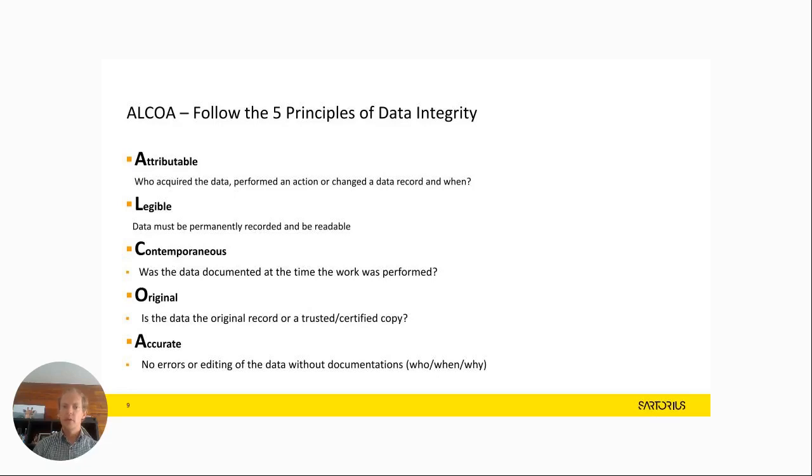The second point, legible. Data must be permanently recorded and be readable. I had applications where I worked not regulated and where the data didn't matter too much. So you maybe write it down and that's it. And sometimes you write it wrong. But here, if you want to follow ALCOA, if you want to be completely compliant, permanently recorded. So we need to have an option for maybe a backup, or that the instrument itself memorizes everything you do.